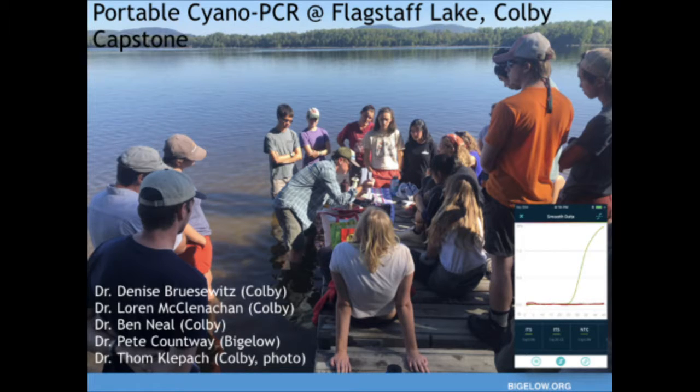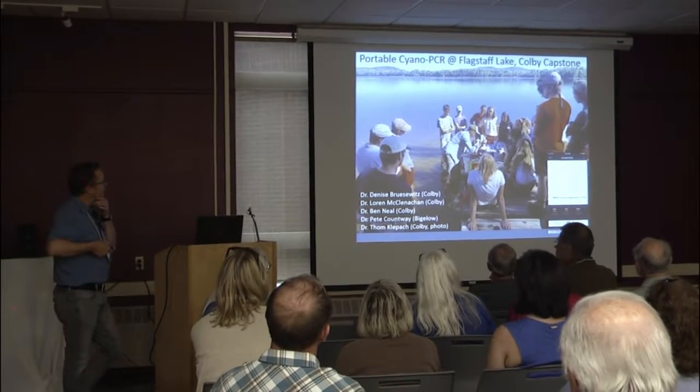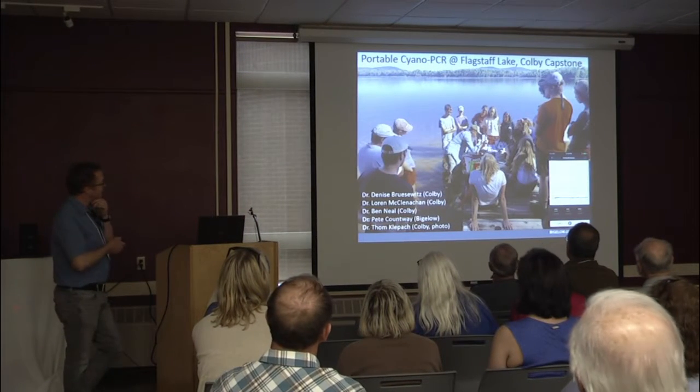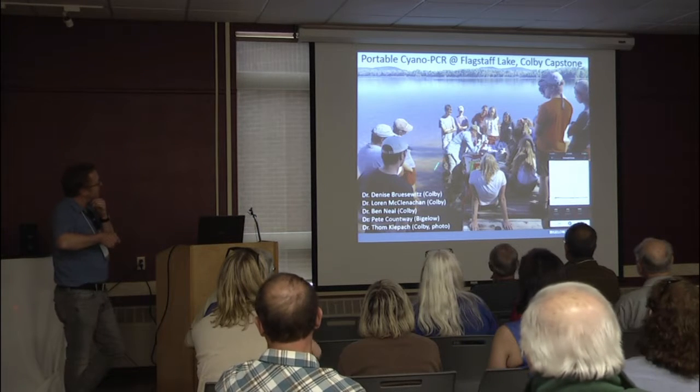Okay, so getting to the point now about what you can do and how you can contribute. I've started experimenting with some technology. It's smartphone based, driven by an app, and it's a tiny little machine that you can take out into the field. This is last fall with a group of students from Colby College. We're out at Flagstaff Lake. We hiked in 2 miles and collected a water sample right here. You can see we're actually standing in the water.